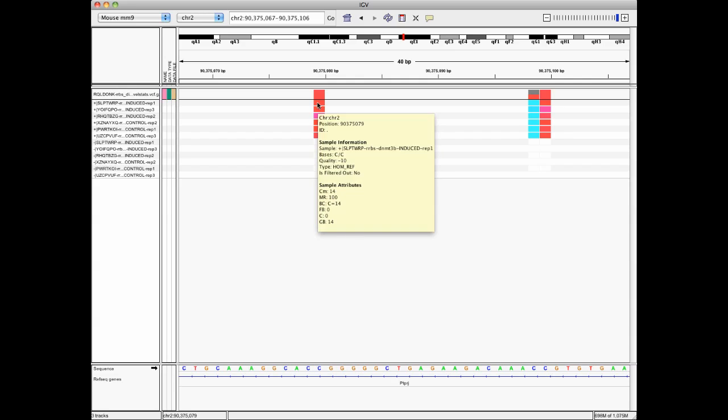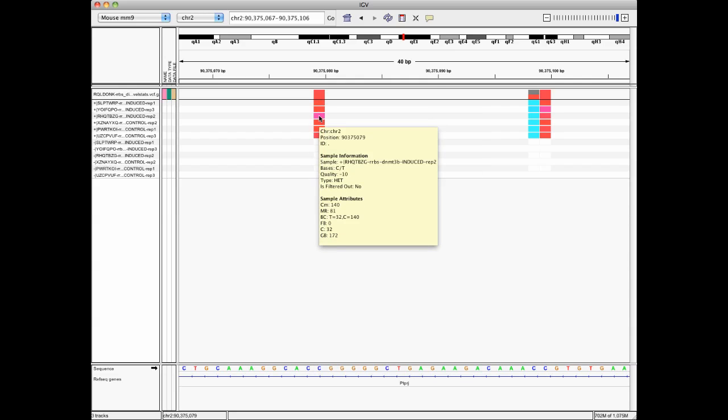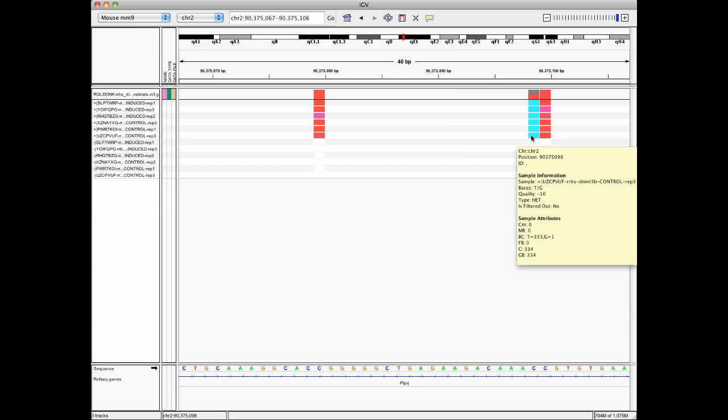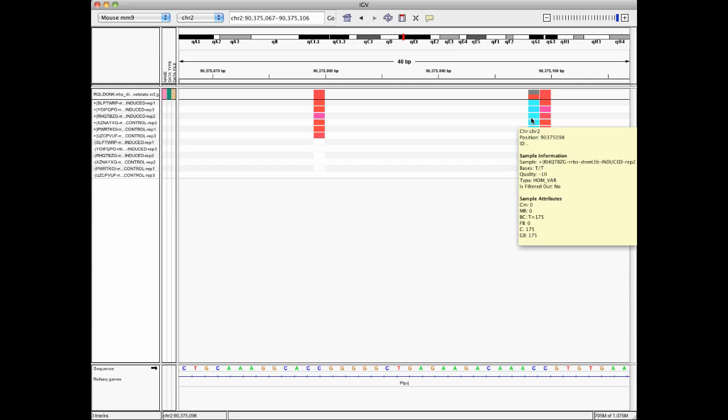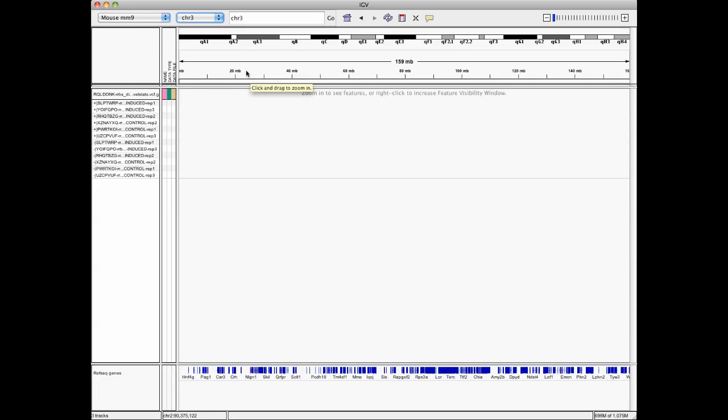So across all samples, you have relatively high methylation rates. Here, 81% methylation, 100, 100, 100. And see, here's an example of low methylation. So this is cyan, 0% methylation at these sites. So you can visualize the methylation rate for different genomic positions.